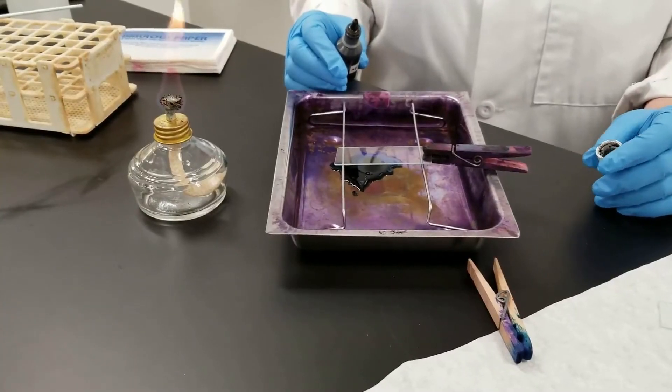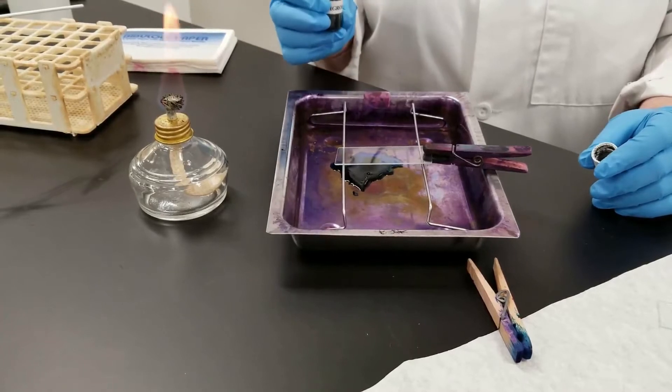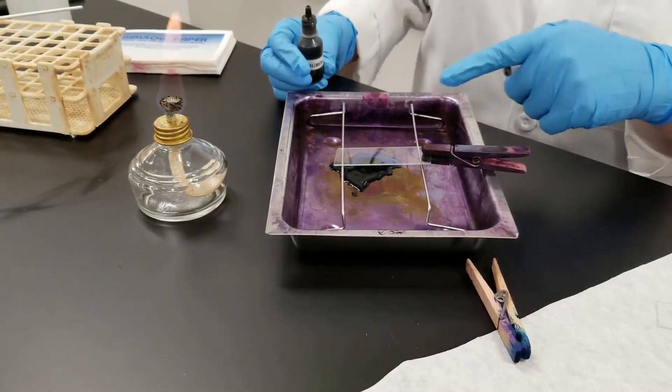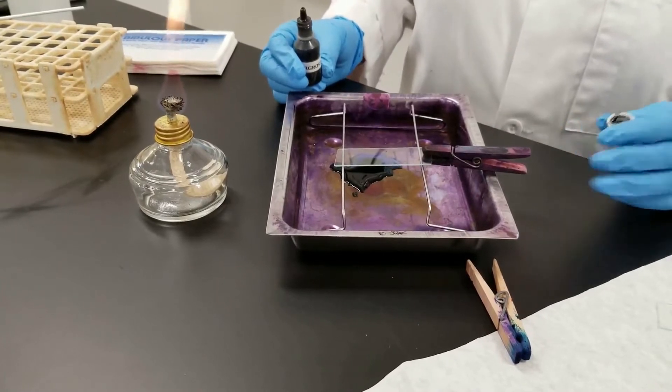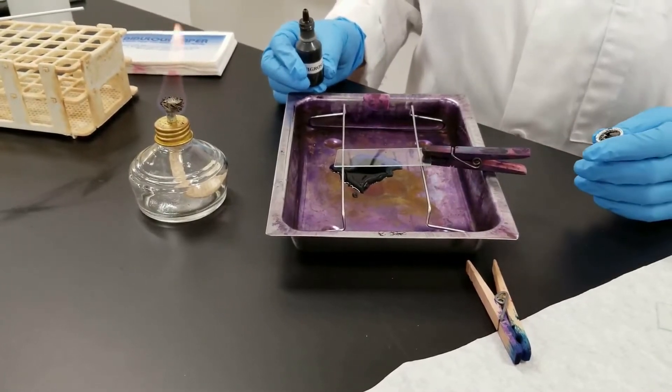So this is a negative stain. We're going to use the Di Negrosa. We have on our slide here the culture of Bacillus Megatarium. We've already smeared it on there so it's ready to go.